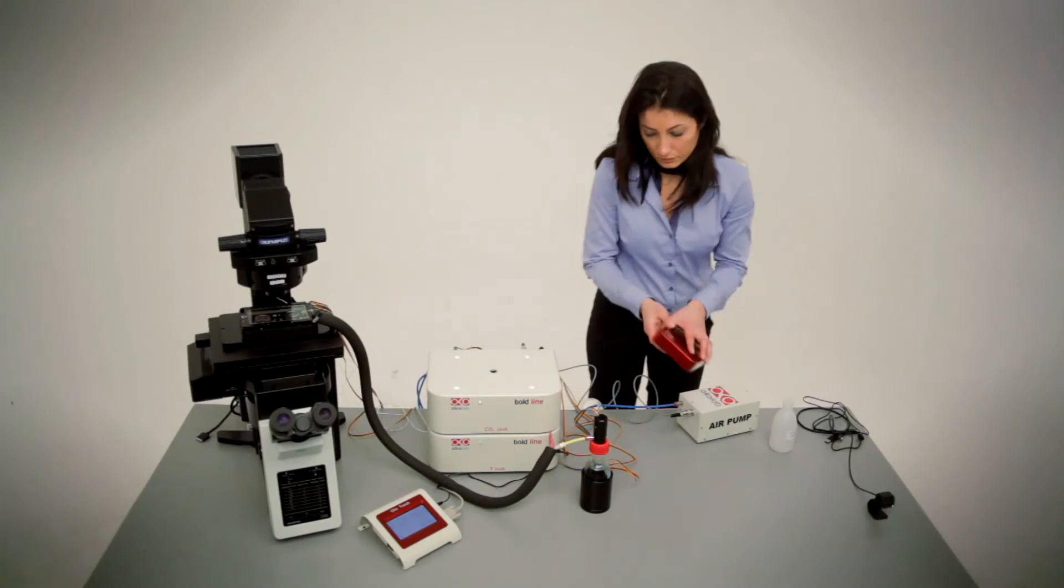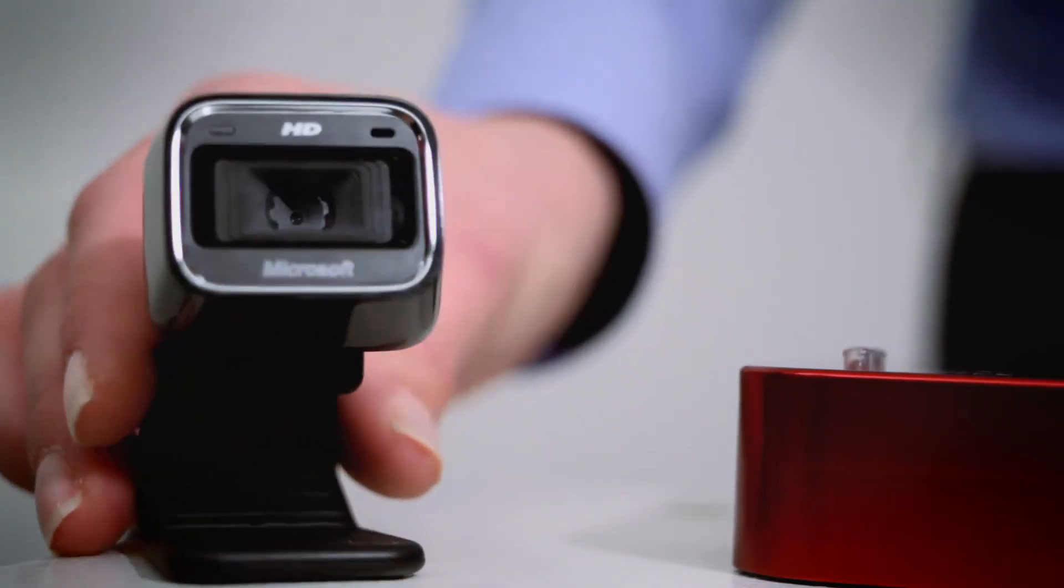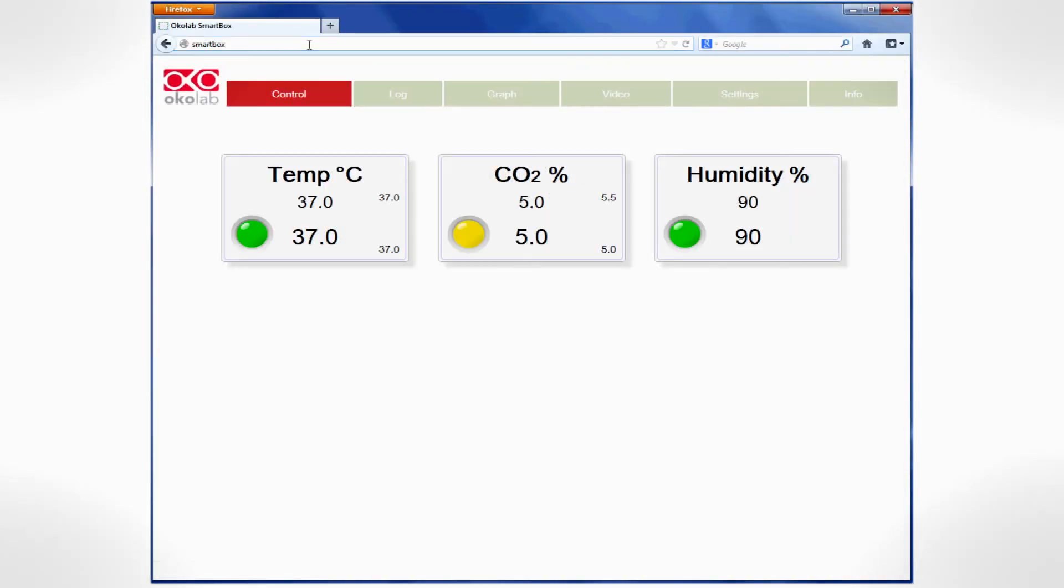Finally, the Boldline system can be completed with the Data Logger, a mini-computer that allows remote operation, video streaming and data storage.